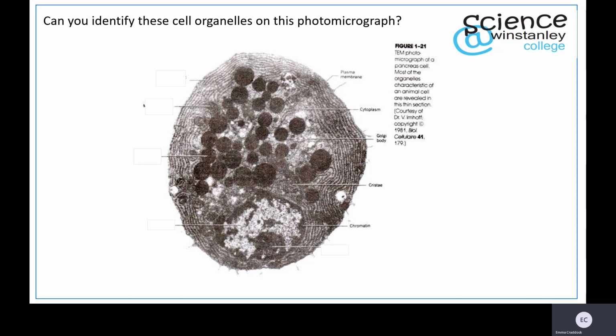It's important to be able to identify different parts of the nucleus from a photomicrograph. So here you can see it is pointing to chromatin, that genetic information in your nucleus. Your dense part is your nucleolus, which is where your ribosomes are synthesized and assembled. And then you also have your nucleus, so that's your overarching label.